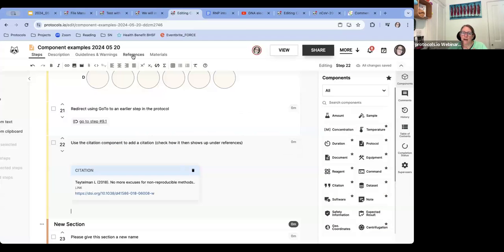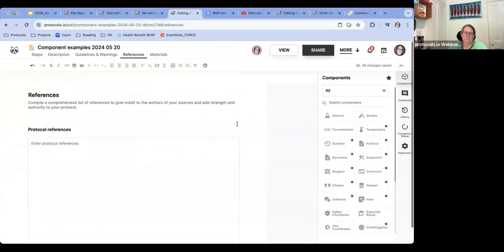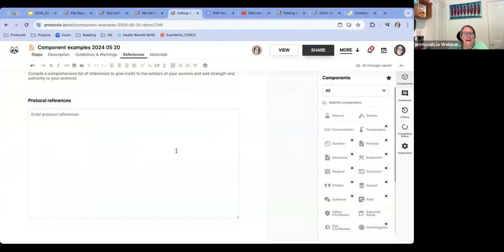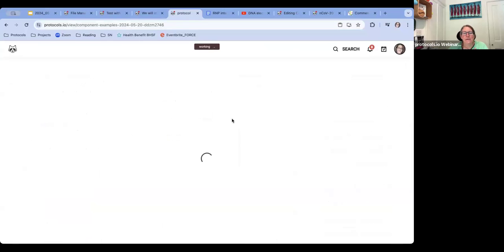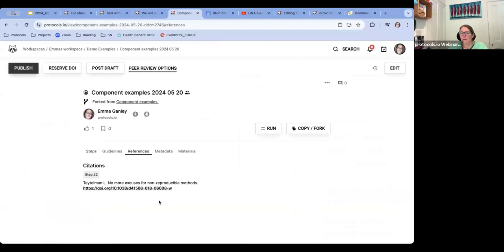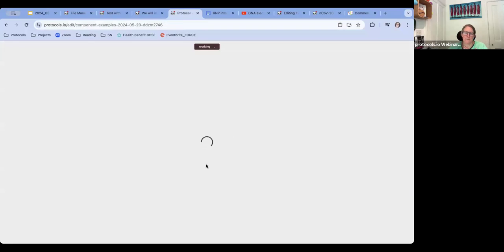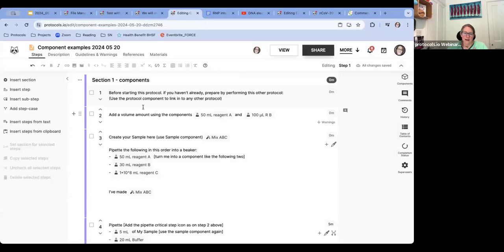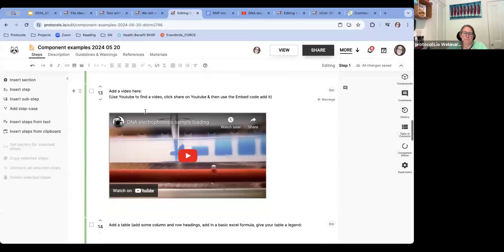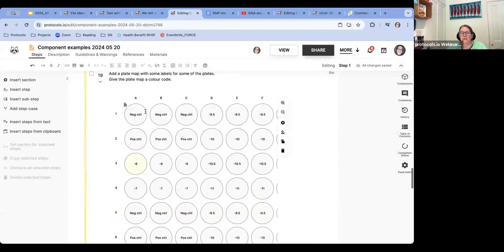It will also add it, I promise you, maybe I need to view to see it in the references. It should pop it into the references. There we go. Now we have the reference in there as well. We'll go back to edit for now. We're down to 22, aren't we? So we've got the citation in.